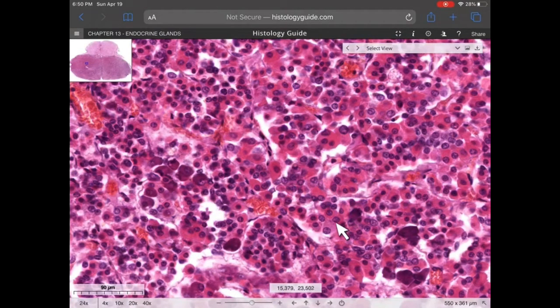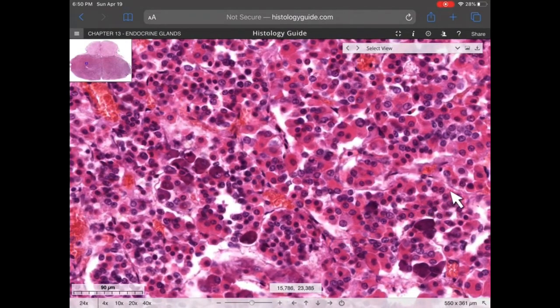And then we've also got chromophobes. Chromophobes means color fearing. So these are cells that don't like to pick up stain very much. So there's a chromophobe. There's another one right there. So any cell that's not dark purple or bright pink, basically. The reason that these cells are different colors is because of the different hormones they produce. Again, you don't have to put a hormone to a cell type here. I'm just proving to you why the two regions of the pituitary are different.